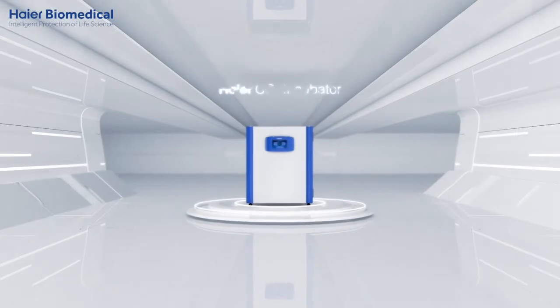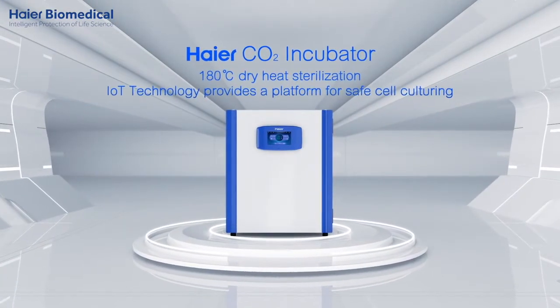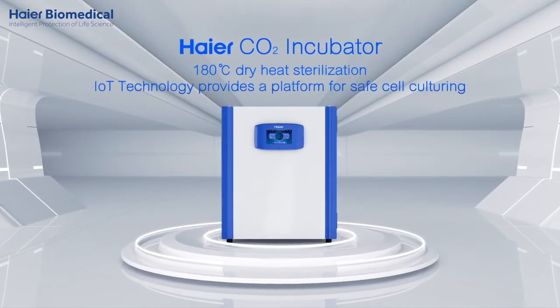Introducing the Hiya CO2 incubator, featuring 180 degree Celsius dry heat sterilization. IoT technology provides a platform for safe cell culturing.